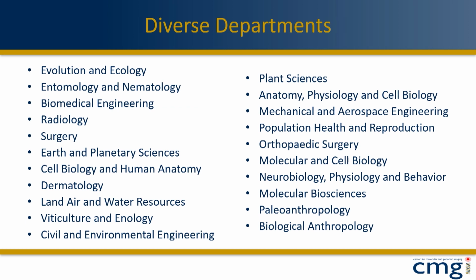I made this slide for a talk that I gave a few weeks ago at Carl Zeiss, and it's mainly based on micro-CT imaging that we do, but it really does encapsulate a lot of the other programs for the in vivo imaging that we do. You can see the array of departments. We also do recharge work for academic institutions and industry as well.